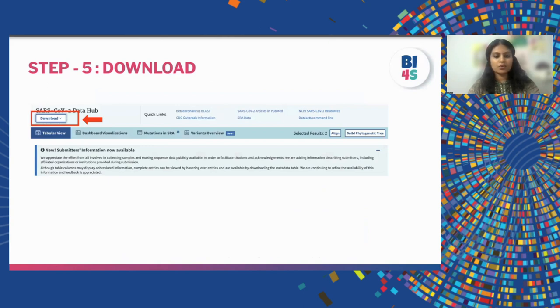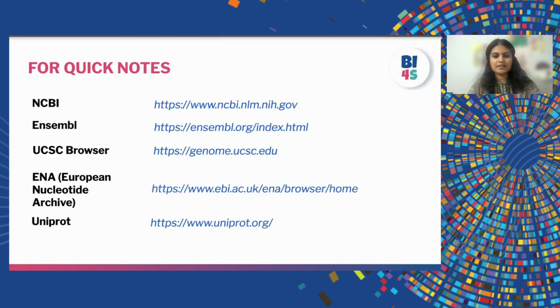The last step is the download step. In the upper left corner, we are going to find the download button. When we choose that, we are provided with options for what kind of download and what format. As we saw in our previous lectures, the sequence format is usually downloaded in FASTA format — the standard format for sequence files — so we are going to choose that. We need to download both the nucleotide as well as the protein sequence, so one by one we are going to download both.